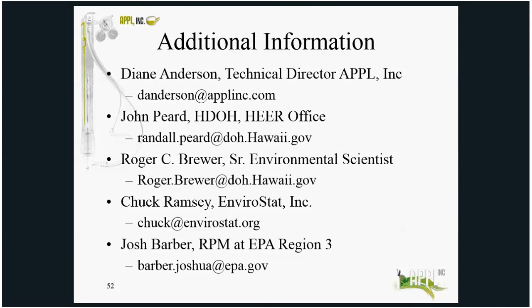Sorry. Do you grind the sift portion of your samples or the larger particles only or both? We only grind the sieved. Well, it depends on what you're doing with the MIS. Typically, we grind the sieved portion. The stuff that's left on top, we don't touch again unless the customer asks us to do that.